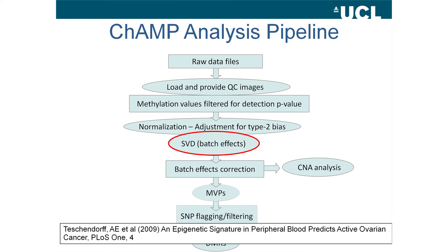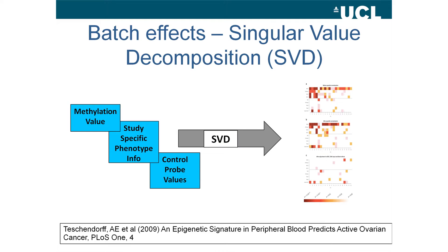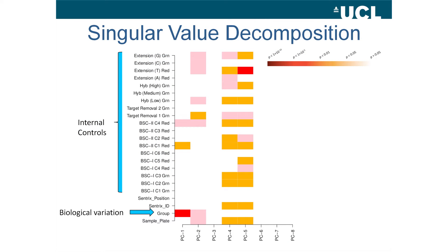I'll start by talking about the SVD batch effects analysis method, which was originally published by Andrew Teschendorf for the 27K. It takes the methylation values - the beta or M values - along with any study-specific phenotype information you have about your study, such as age, date it was run, and also the control probe values that you get from Genome Studio. This results in a heat map.